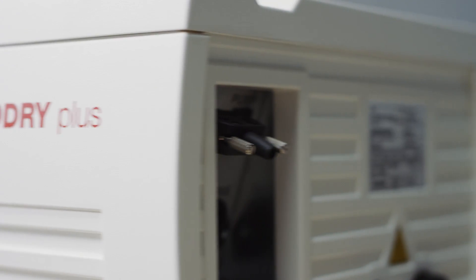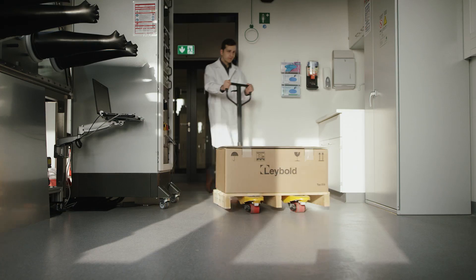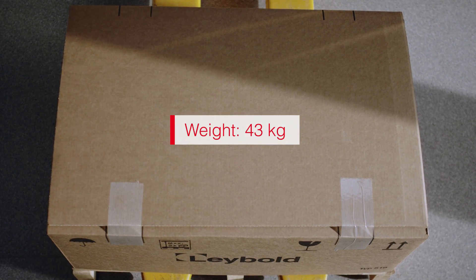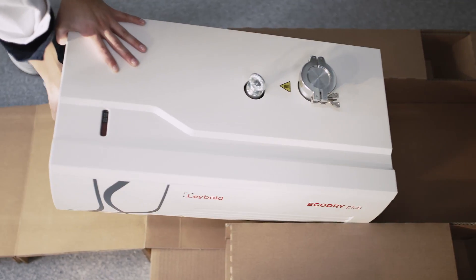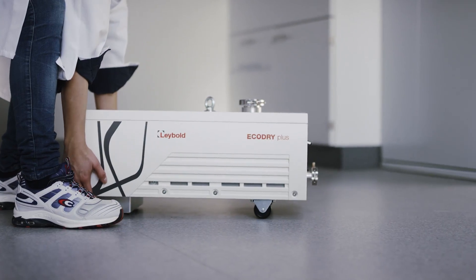The new eco dry plus — the quietest vacuum pump in its class — makes your work more pleasant than ever. Here's how it is delivered: securely and cleverly packaged, weighing only 43 kilograms. Simply remove the lid, fold out the ramp, and roll out the pump, gliding on integrated wheels. The eco dry plus is right where you need it, and one person can move it around easily.